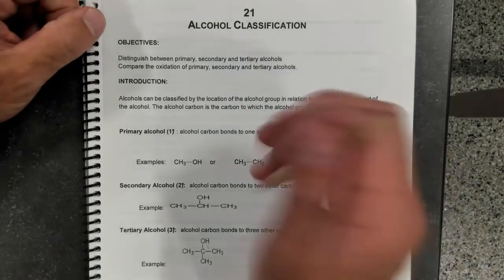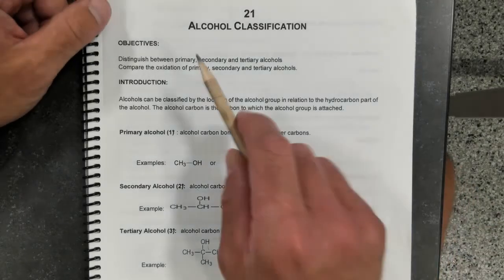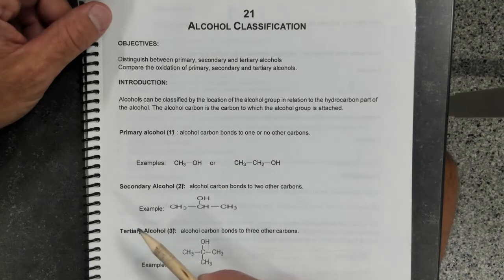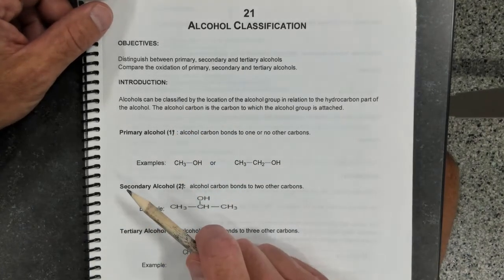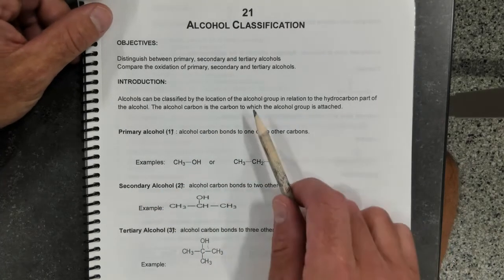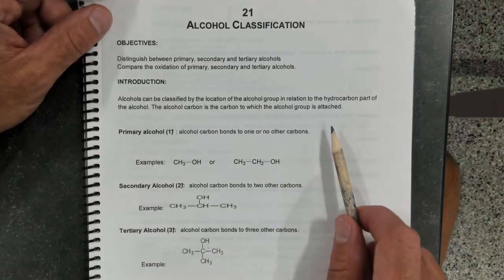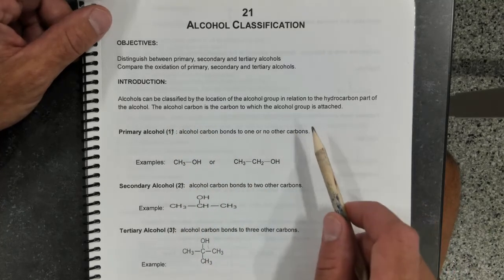In this lab, the alcohol classification will make an attempt to classify alcohols as primary, secondary, or tertiary and compare the oxidation of those chemicals. So the classification of alcohols can be based on the location of the hydroxyl group in relation to the hydrocarbon chain of the alcohol. The alcohol carbon is the carbon to which the hydroxyl group is attached.